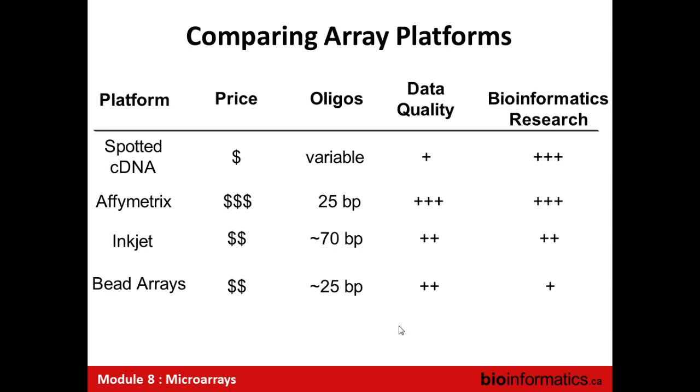So my group has a paper that came back from a good quality journal with revisions, and the revision said, can you do some RNA stuff to give us confidence in your DNA-based assessments? And fortunately for us on that project, money wasn't limiting, and we had 80 samples that all we had to do was generate the data and analyze. We chose to do microarrays instead of RNA-seq because if we did the RNA-seq, we would still be analyzing the data 2 years later or 18 months later. With the microarray, we were able to get the samples to the array center, get the data back, finish the analysis, and get it into the paper in 8 weeks. So there's clearly a turnaround time issue as well.